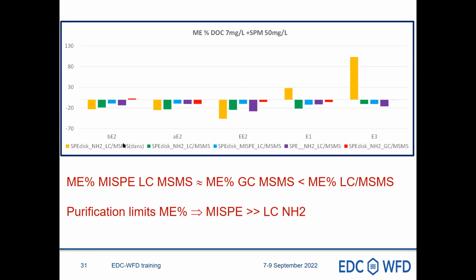But we do not want to manipulate the data. The data is the data. We assume it, but we can inform that usually we are not facing so many matrix effects with this method. So here, yes, purification puts you in good condition. Nevertheless, you have, I would say, reasonable matrix effects even at highest complexity of matrices.